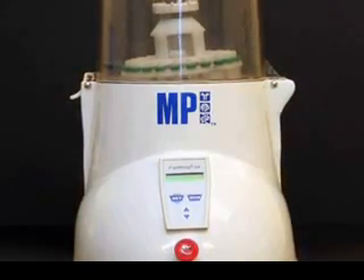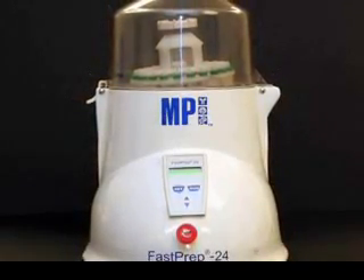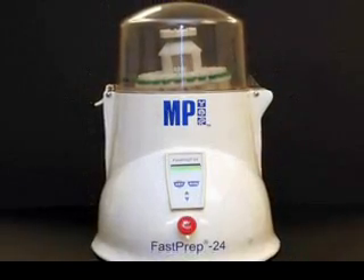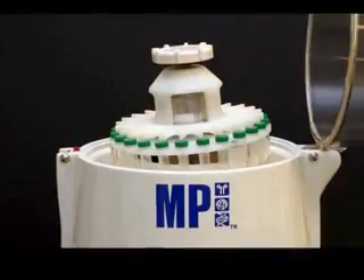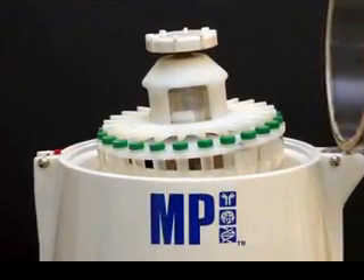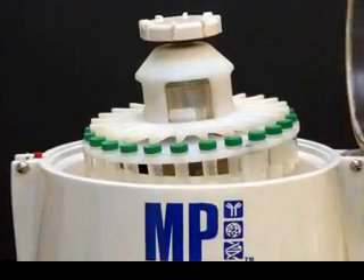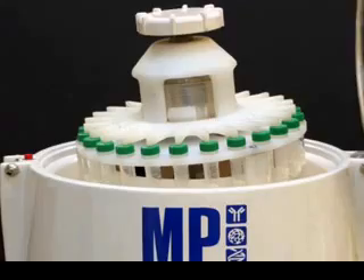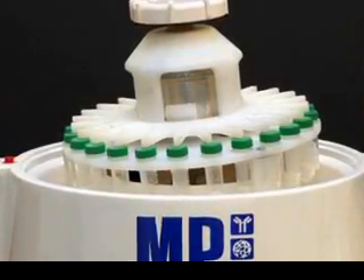We are pleased to introduce our flagship laboratory tool, the FastPrep 24 Cell and Tissue Lysis instrument, which is able to lyse up to 24 samples in less than 40 seconds. The FastPrep system offers a quick and simple method to isolate DNA, RNA, and protein from sources that are virtually impossible to lyse without the use of its rapid reciprocating motion.